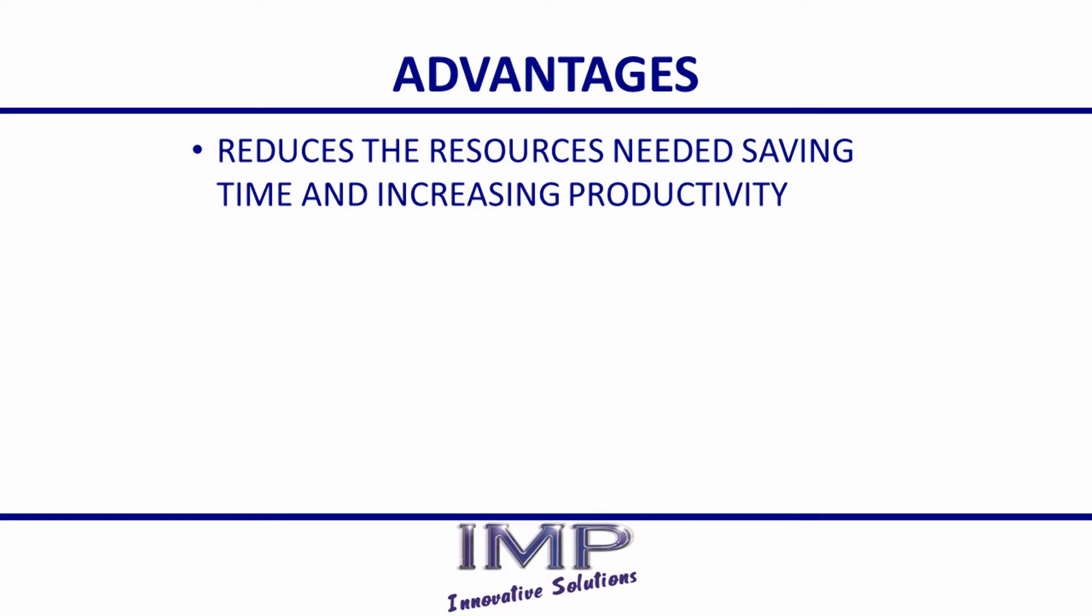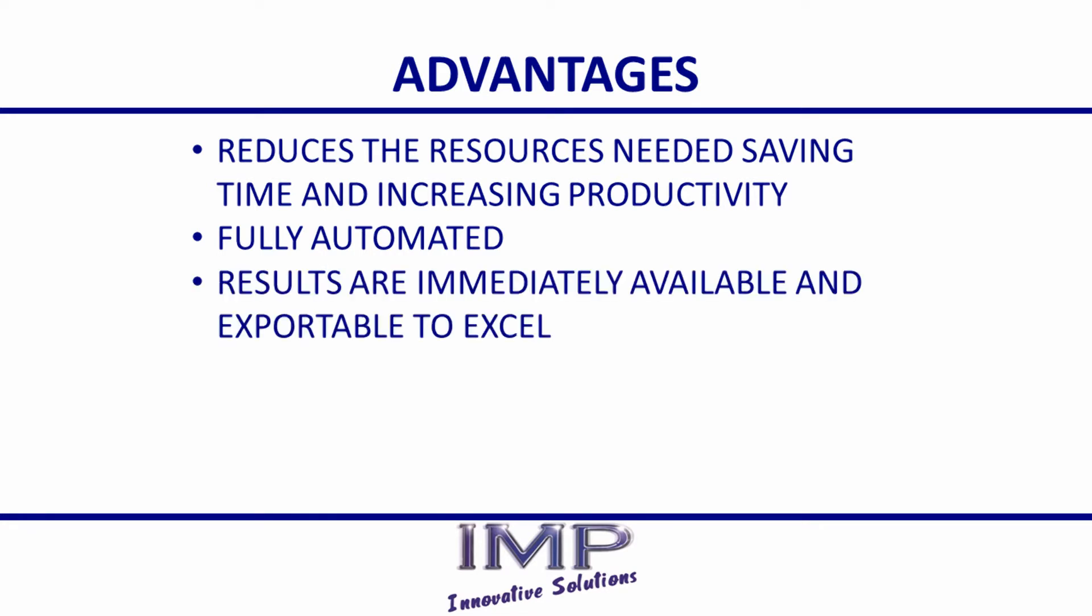The SieveMaster 300 is fully automated from the input of samples to the cleaning and weighing. Results are immediately available to the user and can be exported to Excel for post-processing.